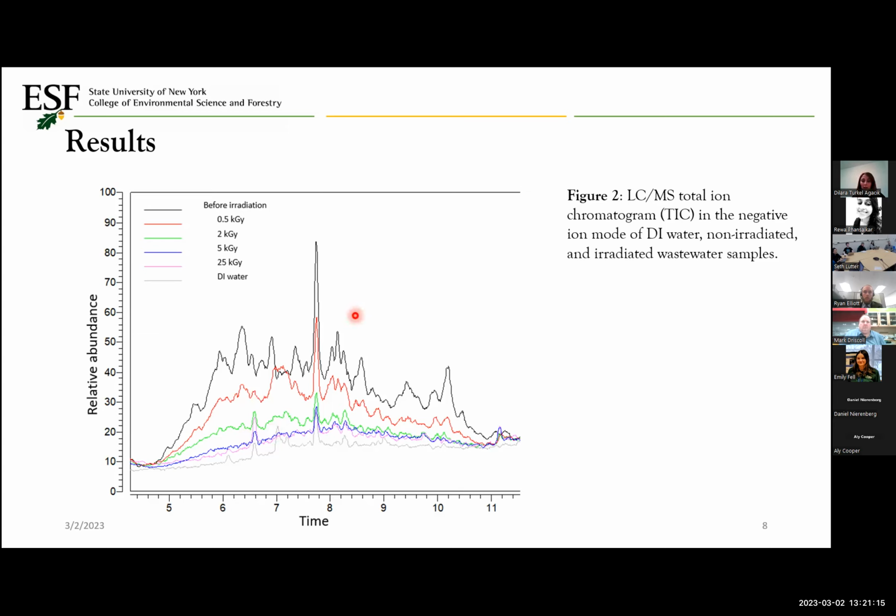And we understand from this chromatogram that with the increasing irradiation dose, the total area under the peaks is decreasing. That shows us as the irradiation dose increases, the degradation also increases. So gray color, I'm not sure if you're able to see this peak, also represents DI water, and it has the least amount of ions, which shows us it has the least amount of total ions.